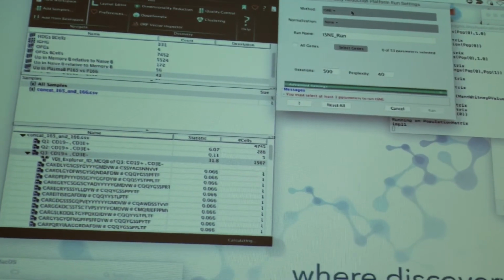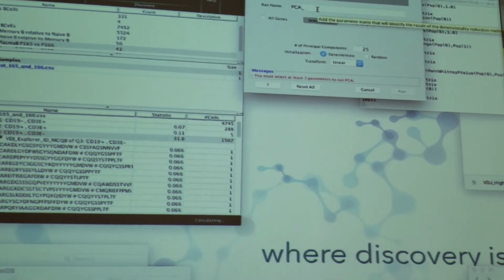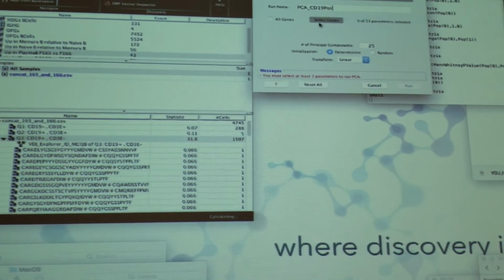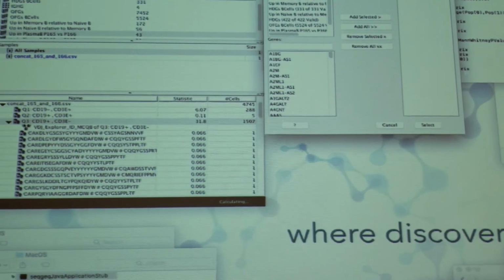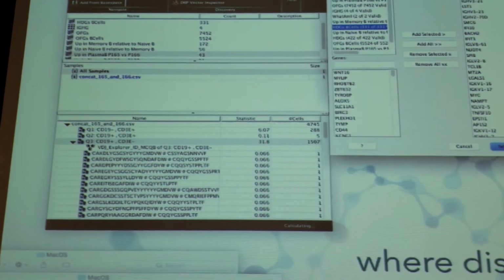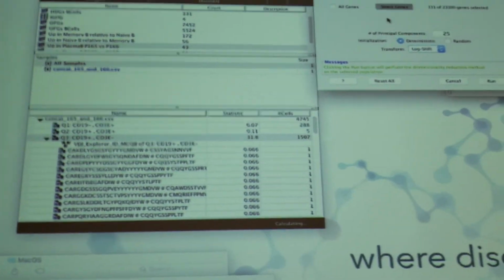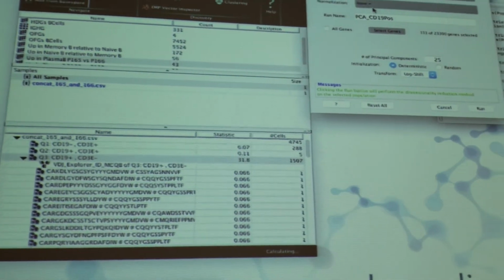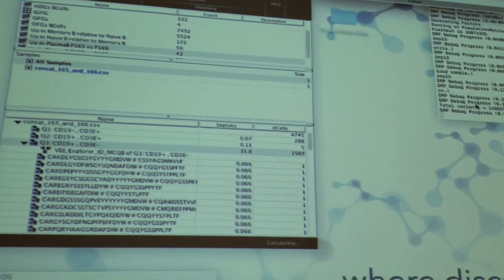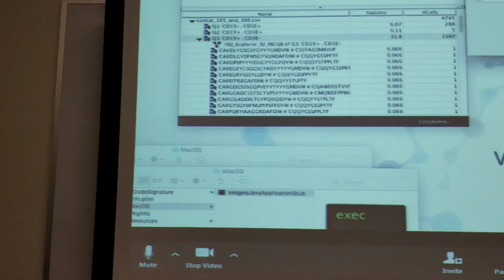So now we're on rerun PCA. We call this pause. Select only these. I have these first genes for B cells, just like you were suggesting. I want to make sure they're the ones for sure. Oh, that's good. Yeah, go ahead. Let me start a new file.